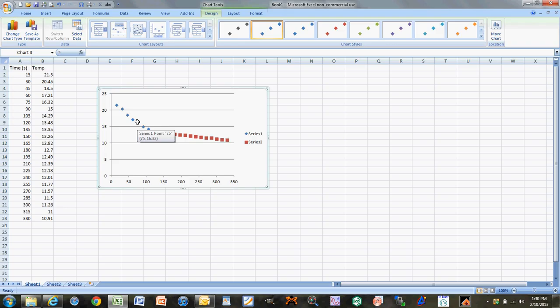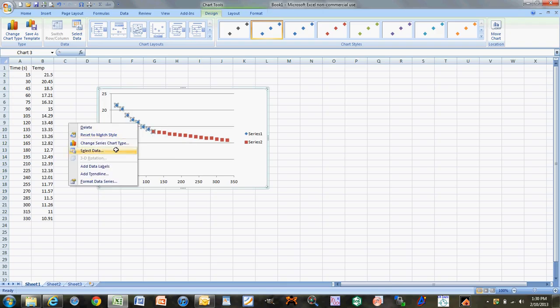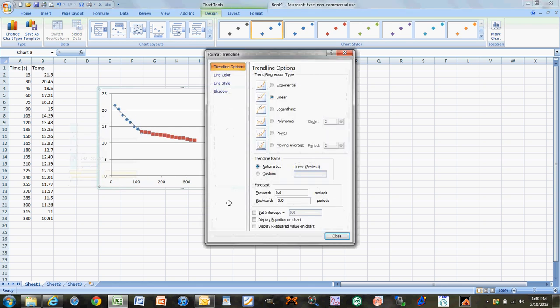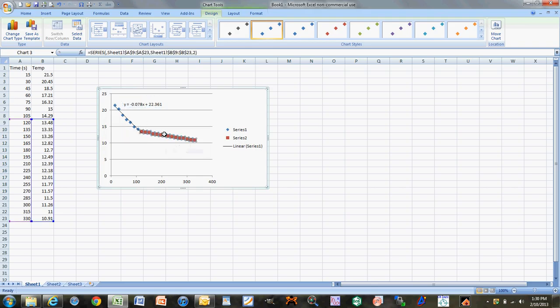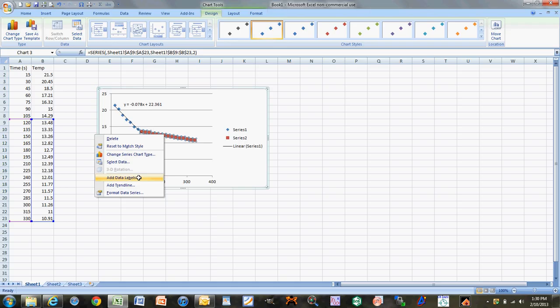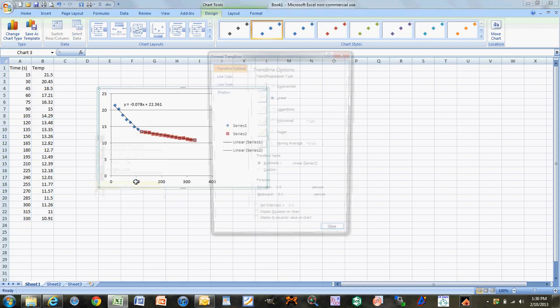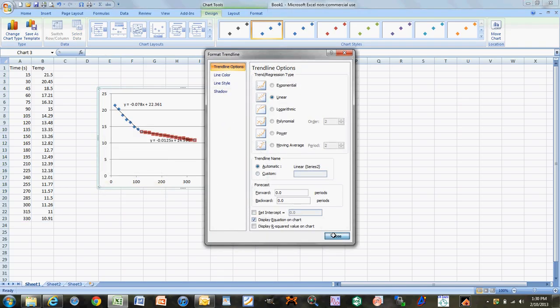You're going to use these two lines to get the freezing point of your solutions. If you just try to eyeball it, you won't be very accurate and your significant figures will be off. Right-click on your first set of data, add a trend line, and display the equation on the chart. Then do the same thing for your second set of data — add a trend line and display the equation on the chart.